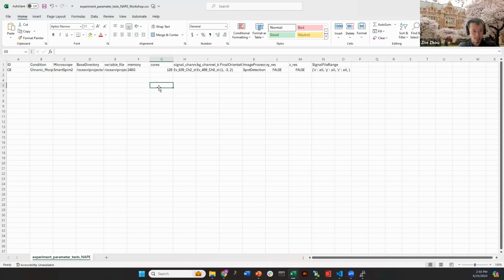I actually have a question here. So this is just one session. If you have multiple, will the main script be generating a new node, or ask for a new node to analyze the second data set?